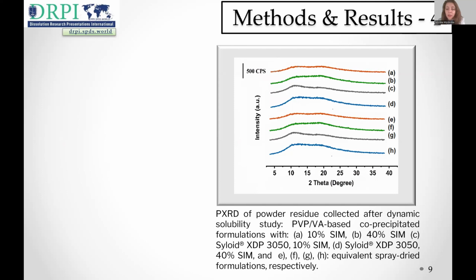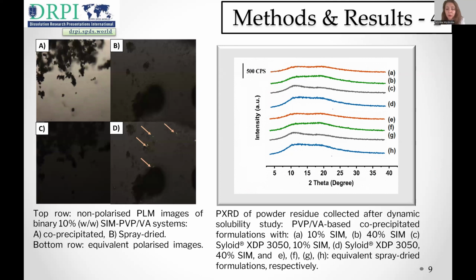To further investigate the solid-state character of the powder residue collected from the dissolution vessel, we used mostly the XRD technique, which presented amorphous character for all systems, and it was in line with results obtained from the dynamic solubility study for the majority of the systems. To further elucidate the fast increase followed by fast decrease in concentration, polarized light microscopy was used in some model systems. There, however, the recrystallization was not obvious, as the birefringence was observed in spray-dried systems at low drug loading, 10%, which, however, was indeed also demonstrated in the dynamic solubility studies, where those systems demonstrated lower concentration at the end of the study relative to other systems.